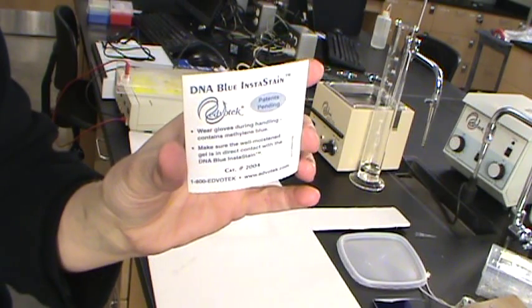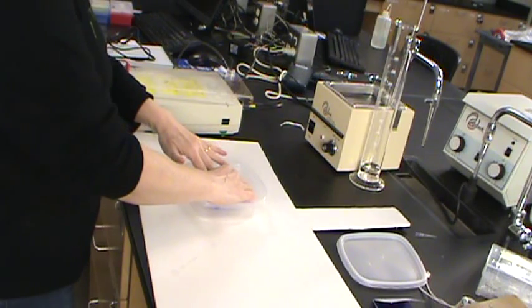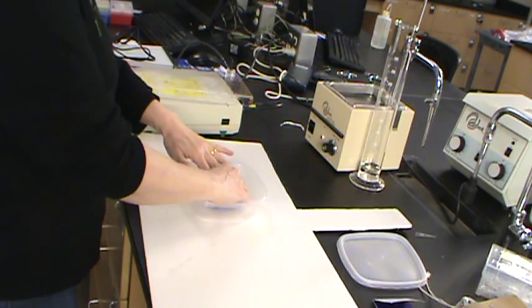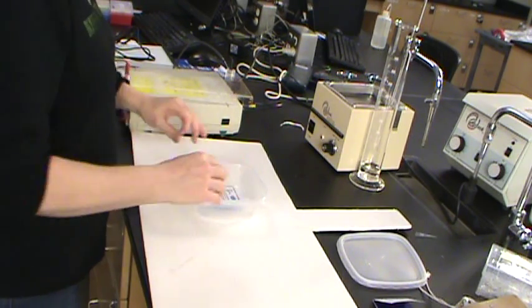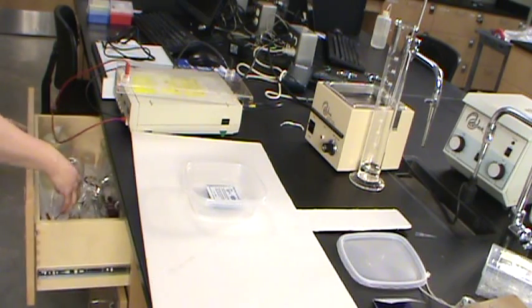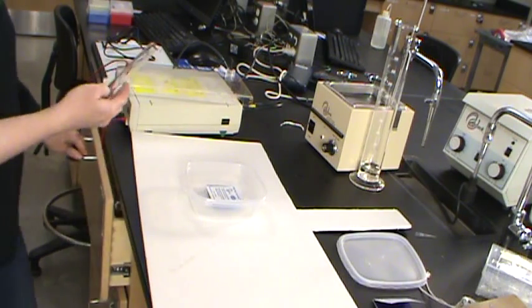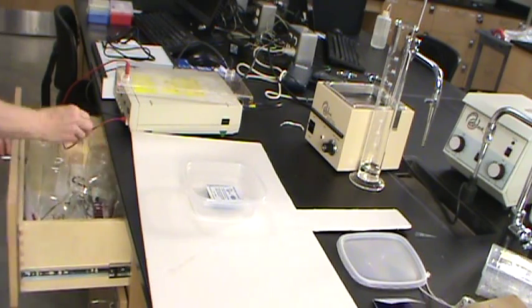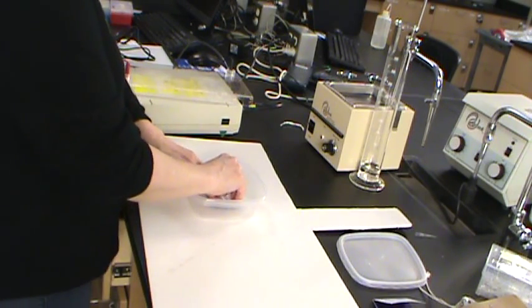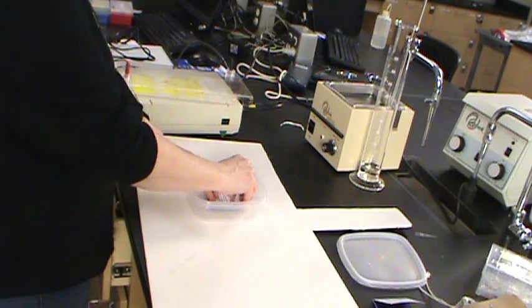And we'll just be able to put that directly on our gel. As long as it's wet, we can put that directly on there, and probably use just a test tube to roll that on there a little bit better. A small test tube might work. Alternatively, we could just use a glass rod or something like that. But we want to make sure we've got good contact of that stain with our gel.